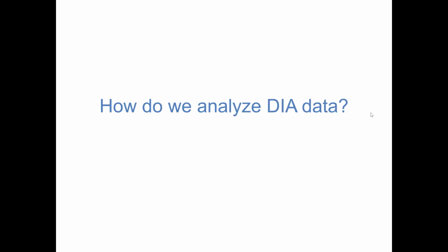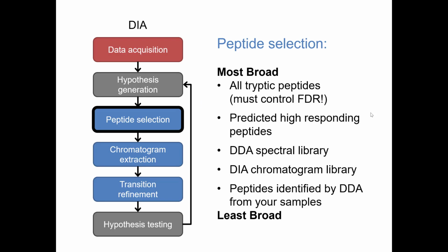Okay. So just to give you a rough idea of how we analyze this data, tomorrow we're going to do a much more in-depth, detailed look at how software analyzes DIA data. But typically, as I said, you would go through this pipeline that we discussed earlier.